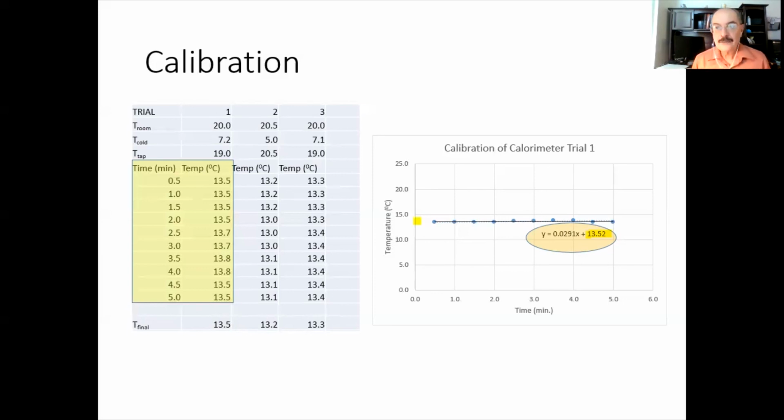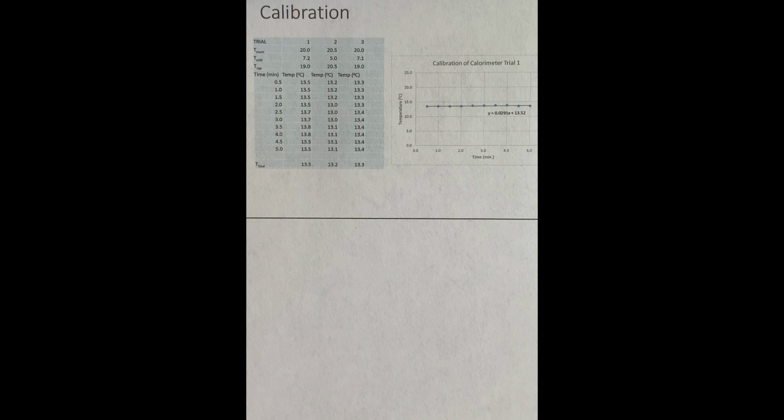All right, now let me take you back to our document camera, and let's see how we're going to handle the calculations of the calibration of the calorimeter. Once more, students, I apologize. We had to re-record this portion because the original Zoom recording was very distorted.